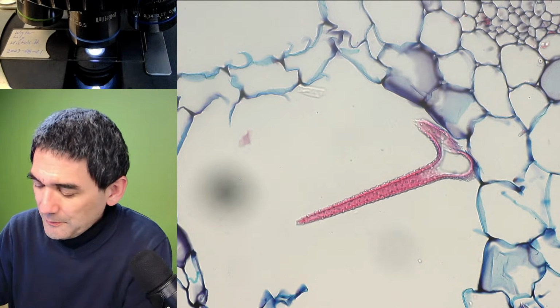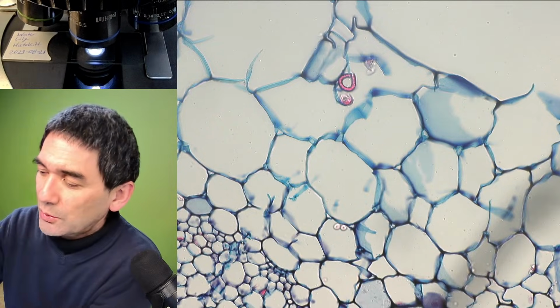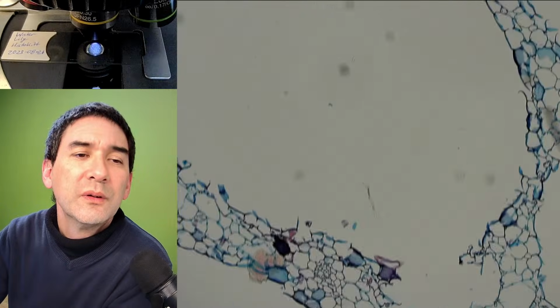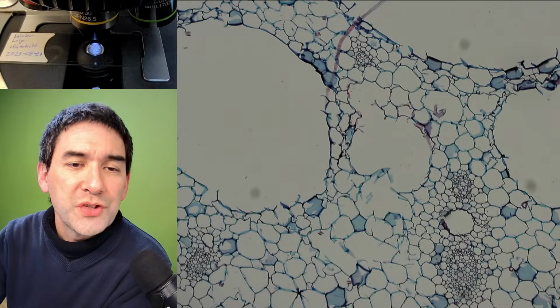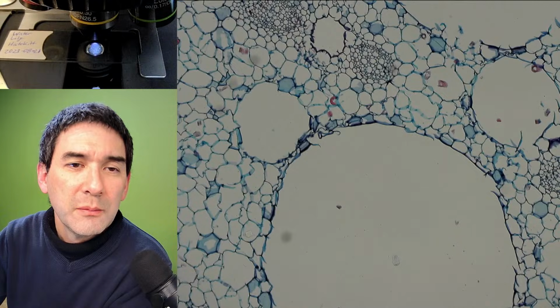Look at another one here. I've seen some really nice samples as well. Let's go down a little bit with the magnification so we get a better overview as always. I think there was, you know what, let's go yet further down. Then you have to scan them a little bit, and then occasionally you are able to find them. Maybe if the cross-section would have been a bit thicker, it would have been a little bit easier to see.